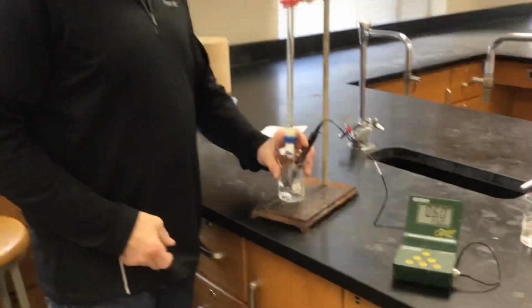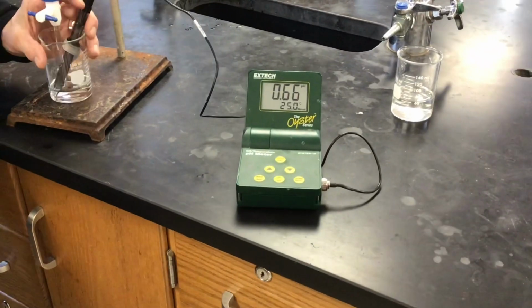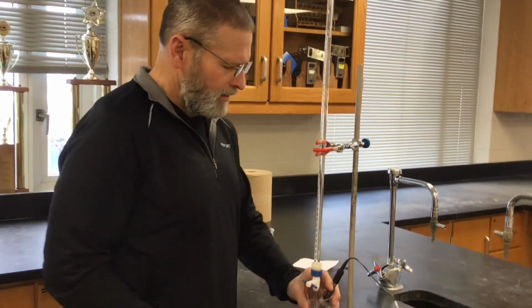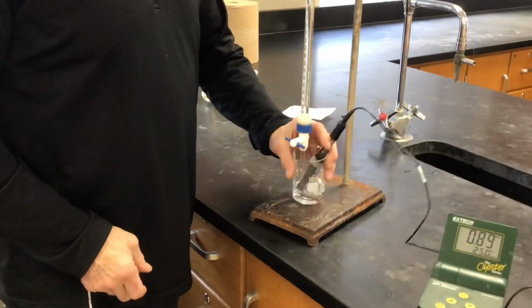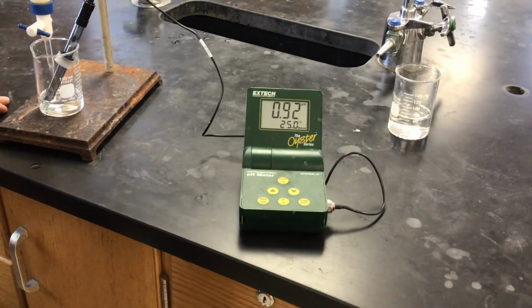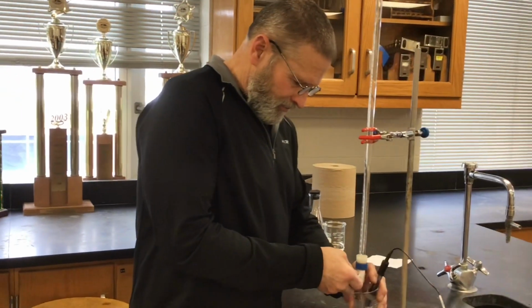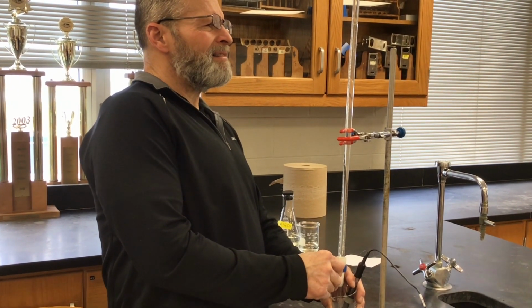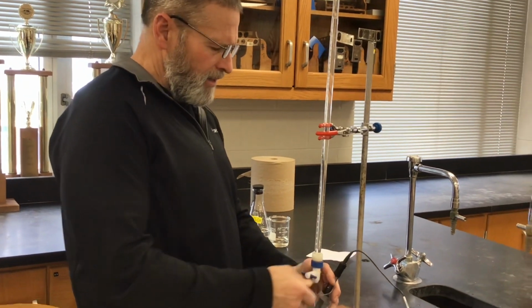There's 8 added. Eight milliliters so far, okay. We're getting some movement now. There's 10.